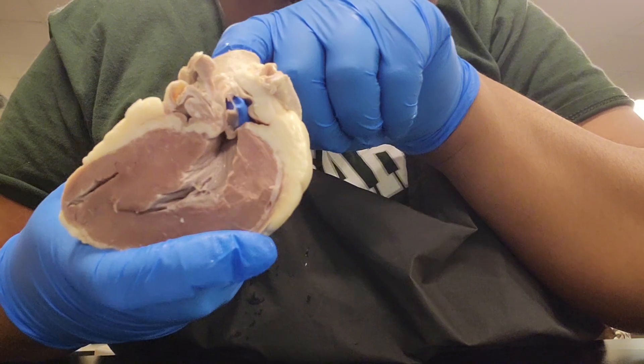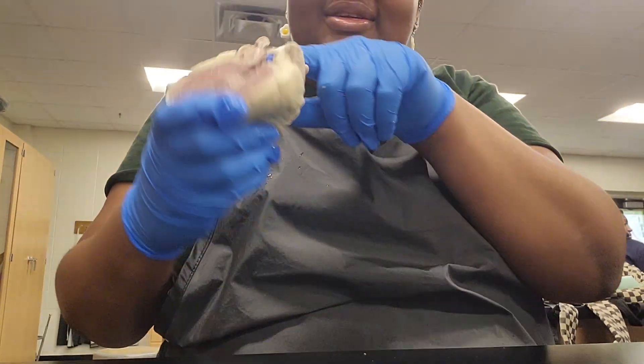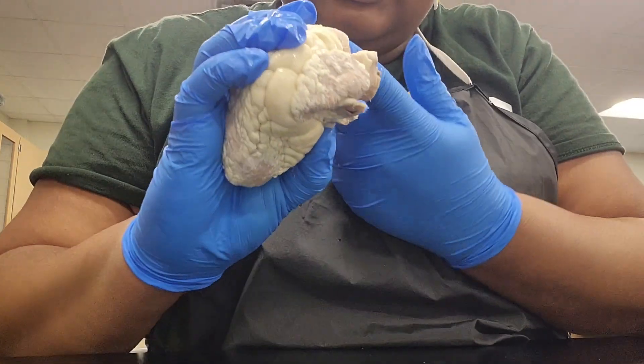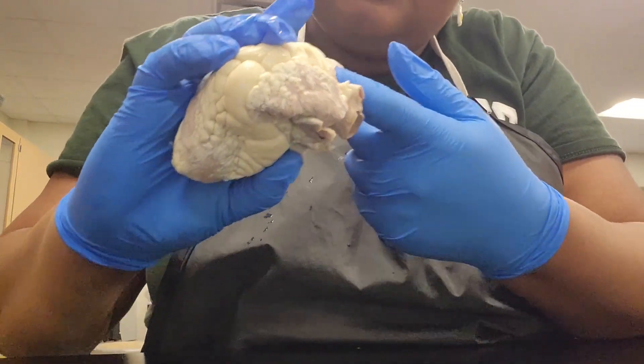It's kind of hard to tell, but I believe the part of the heart I'm currently examining is called the pulmonary trunk, which carries deoxygenated blood to the lungs so that it can receive oxygen. Then I proceed to place my finger into another part of the heart, which I believe might be the superior vena cava, which is the largest vein in the body.